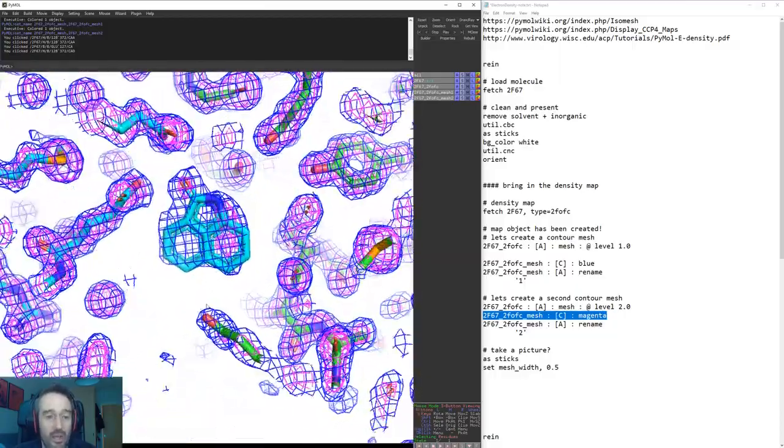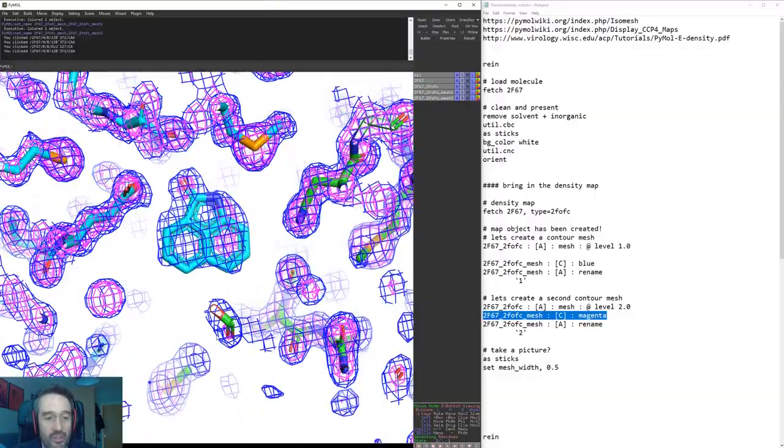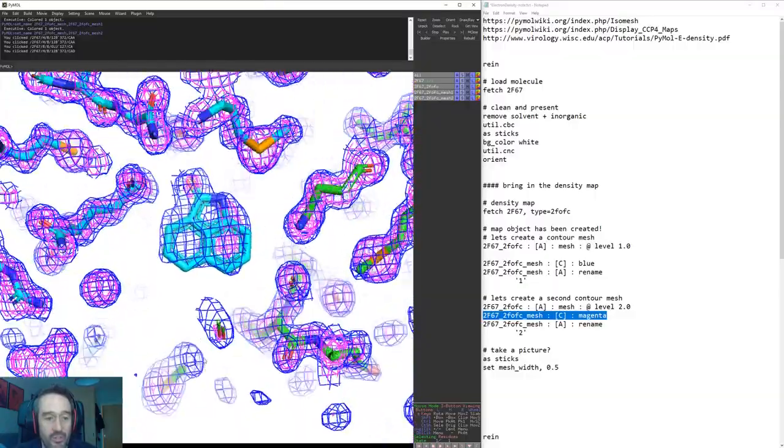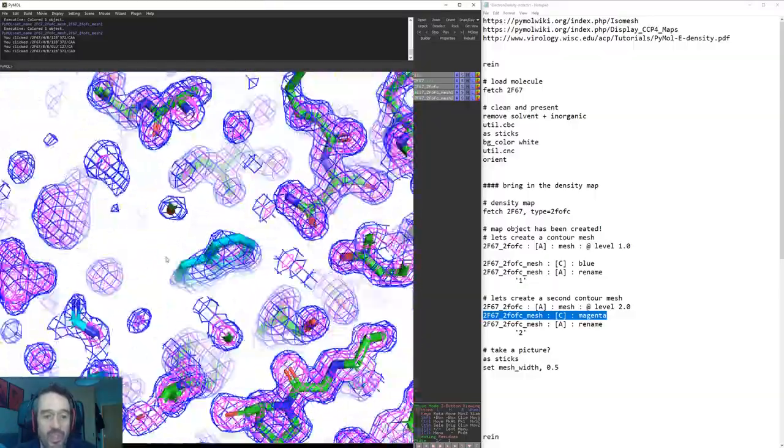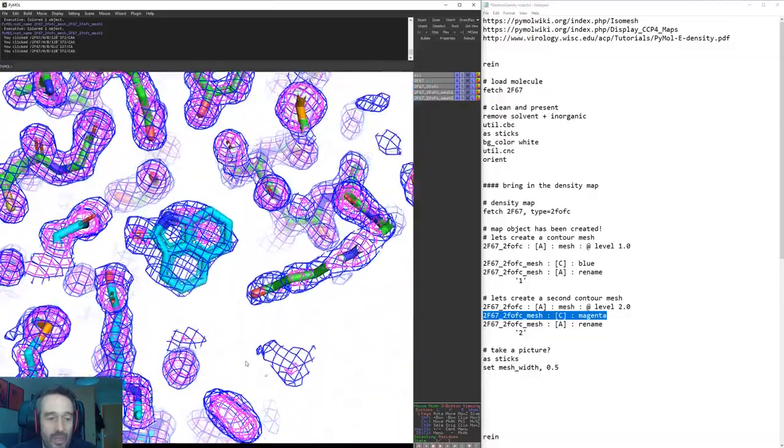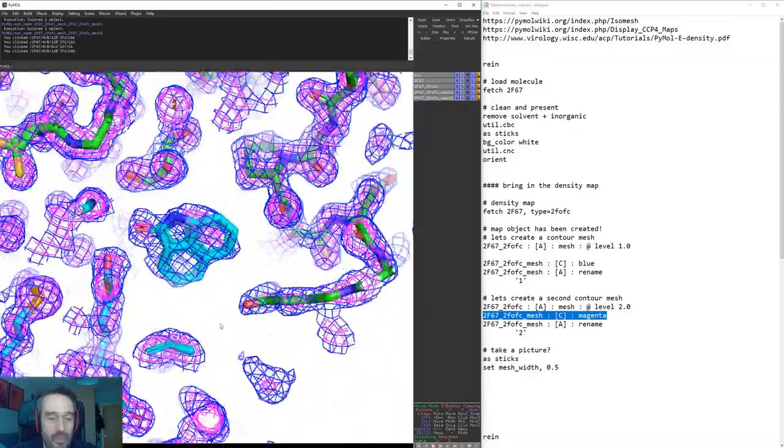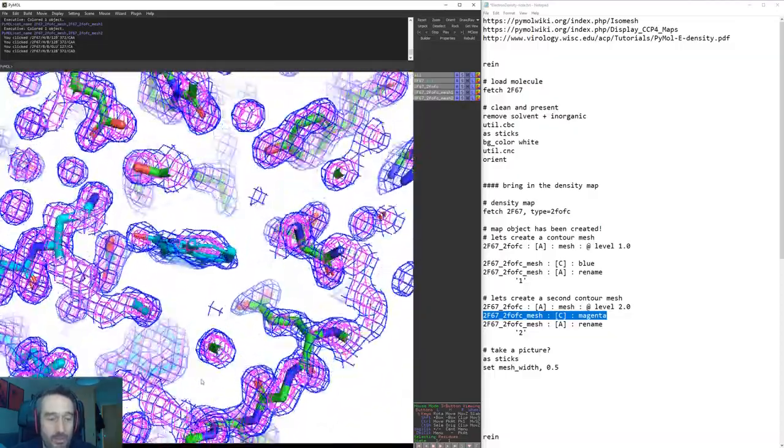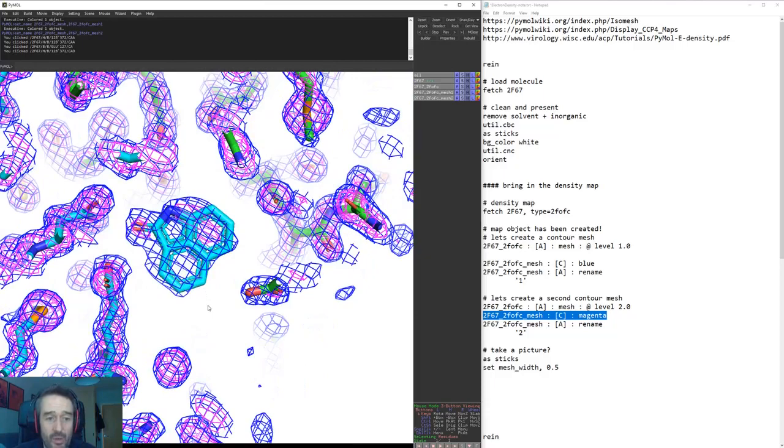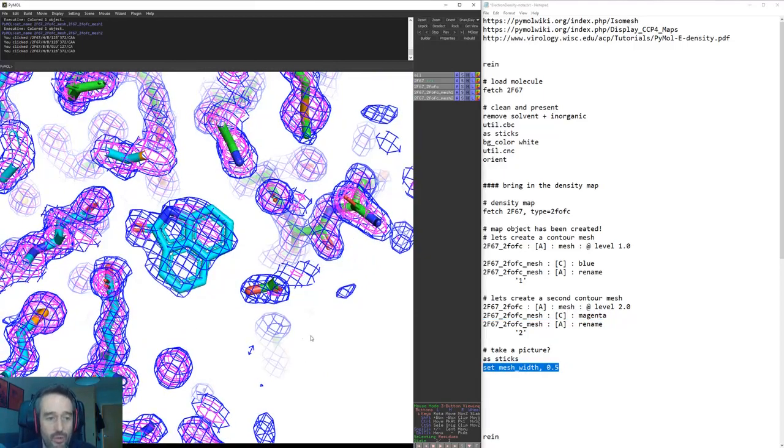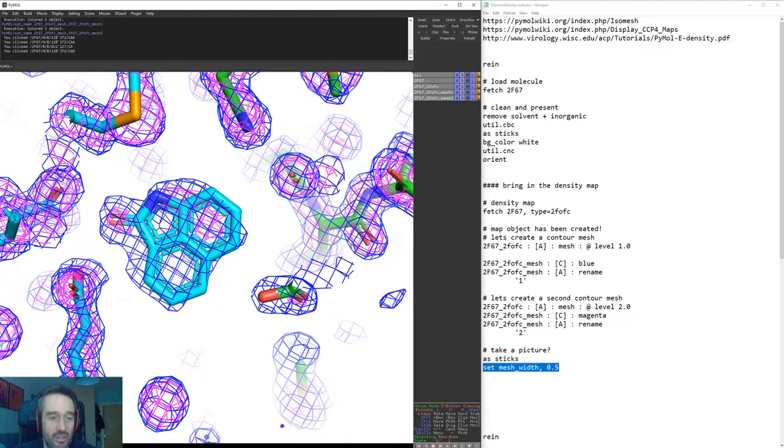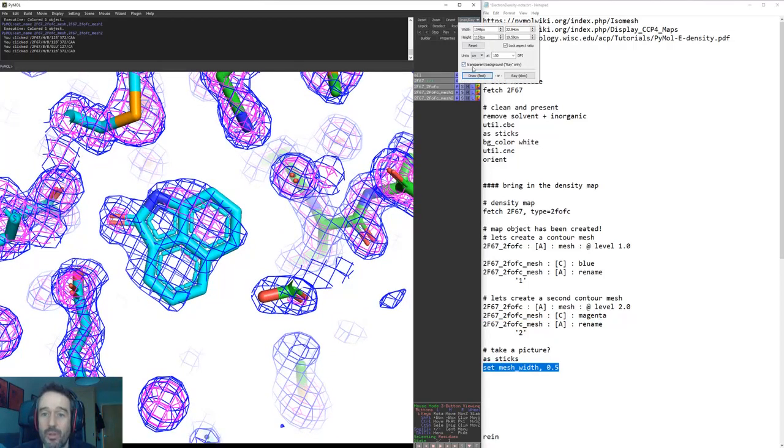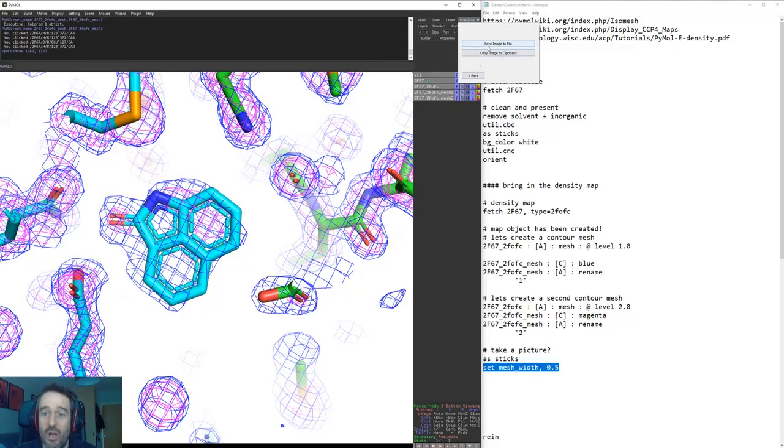However sometimes it is a good idea to look at the lower resolution, or not lower resolution sorry, but the lower sigma values there in order to see less well defined positions of atoms. So we can now take a picture. You can just take a picture using the draw button here.